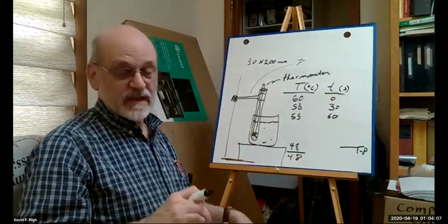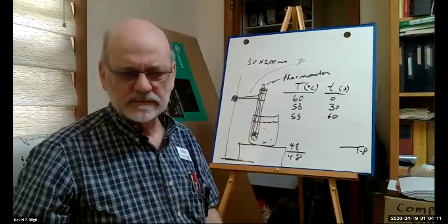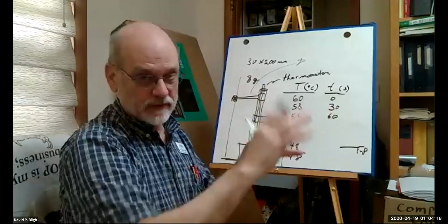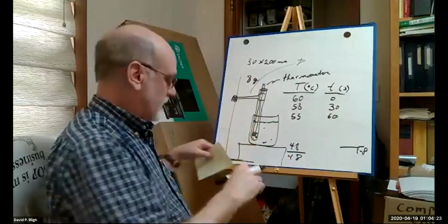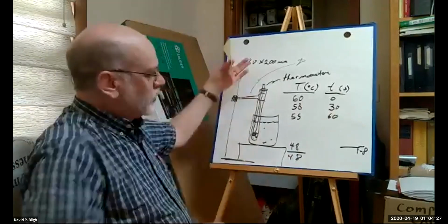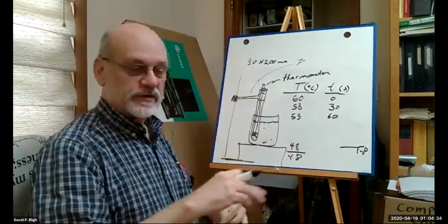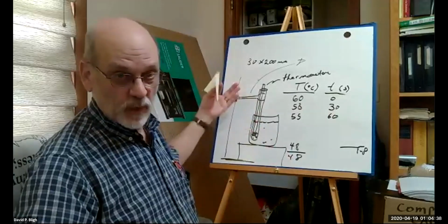Okay? So then you're going to go back, and I think the data says that we put 8 grams, or 8.000 whatever grams of lauric acid in there. Right? Then you go back and you resubmerge your tube in the boiling water, dissolve it again. And while that's happening, one of the lab partners goes over to the balance, probably the same one that weighed out the lauric acid.